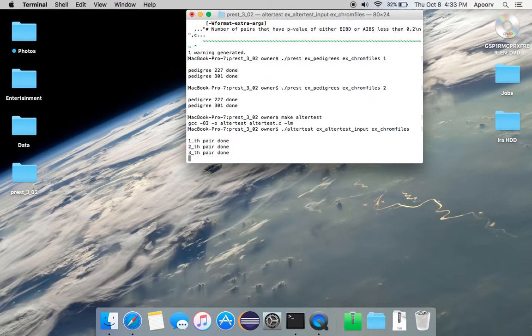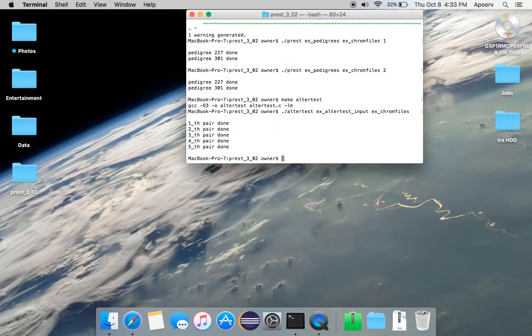So yes, it checks the blood samples which are given as inputs and finds out that yes, this pair of blood samples won't be able to link with each other and can give the linkage error.